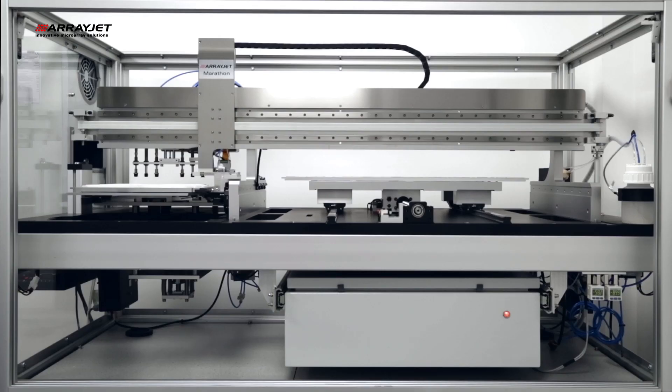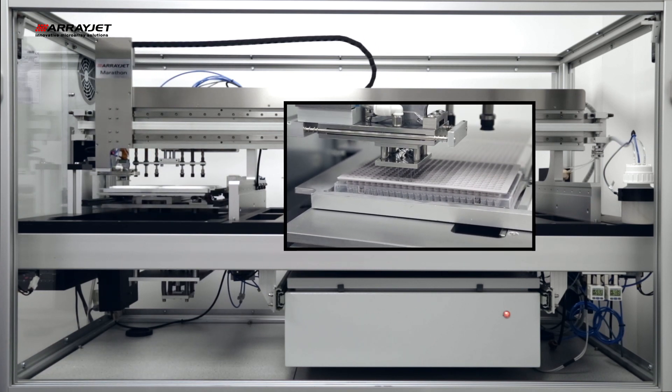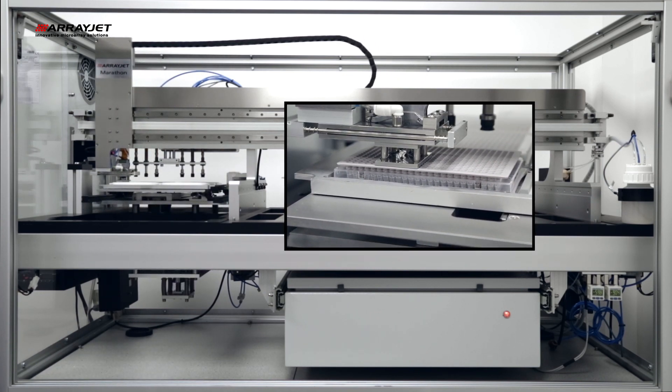The JetSpider is docked to the printhead assembly and then is located over a set of sample wells. 12 or 32 samples are aspirated simultaneously from the wells of the microplate. They travel through the JetSpider's stainless steel capillaries and into the nozzles of the inkjet printhead.